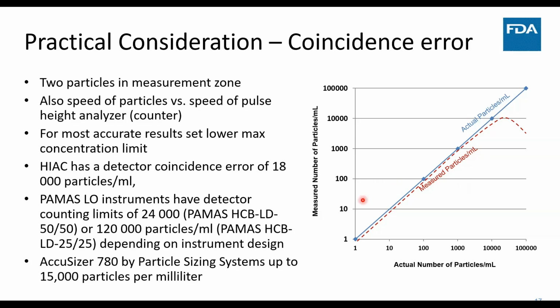So yes, for particles of count greater than 25 micron or even 10 micron, you might not be too bothered about it, but if there's a concern or the need for the company to characterize particles between the size range of 2 to 10 micron, now this becomes something that you would need to look out for.